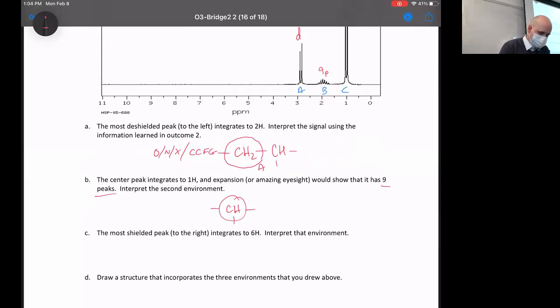Yeah, it has to be 2 CH3s and a CH2. All right, it is right around 2 ppm, but could it also be next to a carbon-containing functional group? How many bonds does carbon make? 4. So it's got an H, it's got 3 carbons, because that's the only way it's going to have 8 hydrogens. So can it have any more bonds? No. So can it be next to a carbon containing functional group? No, because it's got everything.